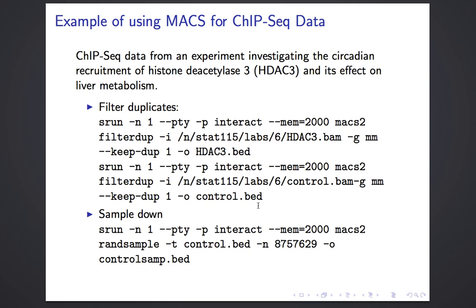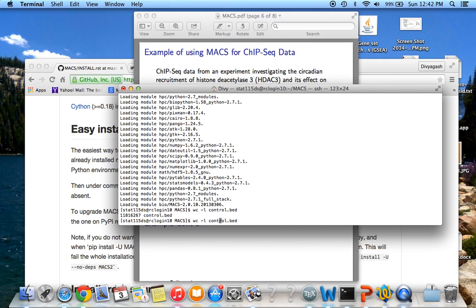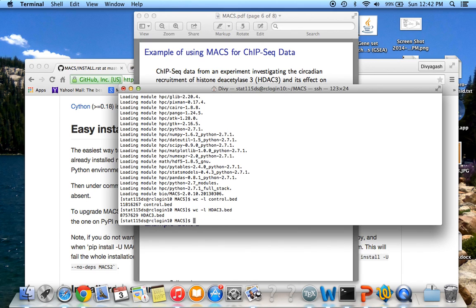After filtering duplicates, I have to sample down if my treatment file and control file have different numbers of reads, because that itself can introduce bias. I use the randsample command on the bigger file. I sample down the control bed file to match the number of reads in the smallest file. The control file has about 11.8 million reads and the treatment file has about 8.8 million, so there's a 3 million difference.